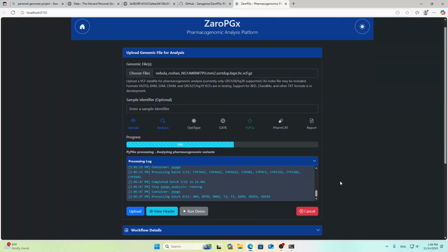Okay, and we're gonna wait for the pipeline to finish now. It shouldn't take too long.